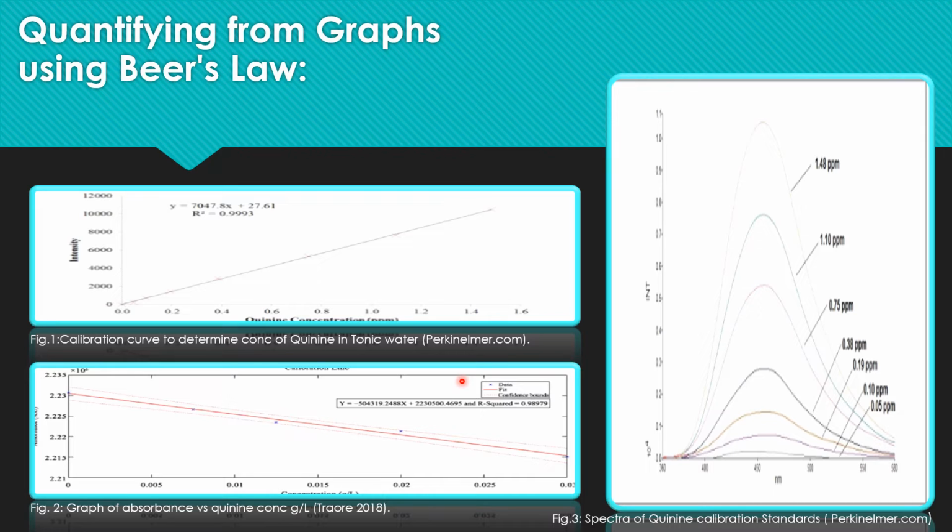On the downside, the atomic absorption spectrometer has been known to pick up interferences, such as spectral, due to background radiation caused from other elemental signals overlapping the analyte signal; chemical, due to the incomplete dissociation of other compounds in the flame; and ionizational, due to high temperature, which causes a number of vaporized atoms to become ionized.